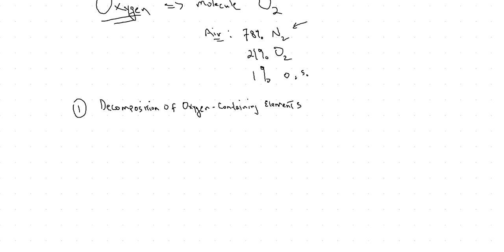First thing we look at is what's called sodium nitrate. That's Na is sodium, NO3 is nitrate. What we're going to do is add heat to this. We're going to put a flame on it, and then we want to see what will happen. In other words, what its properties are and will it give off oxygen?